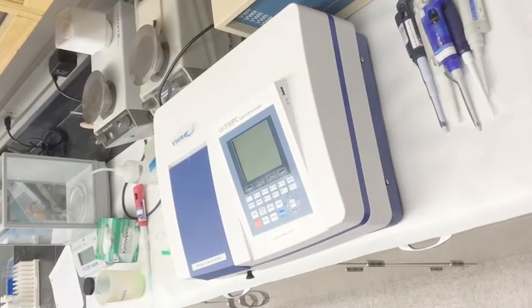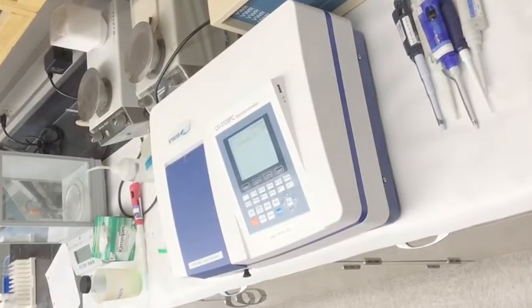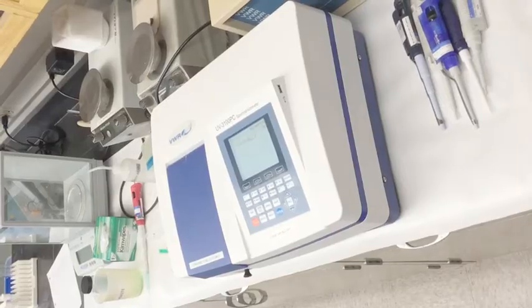To begin, turn the spectrophotometer on by flipping the switch located in the back. You will now wait for 15 minutes to allow the spectrophotometer to warm up.